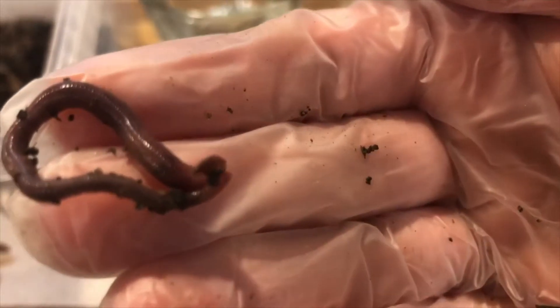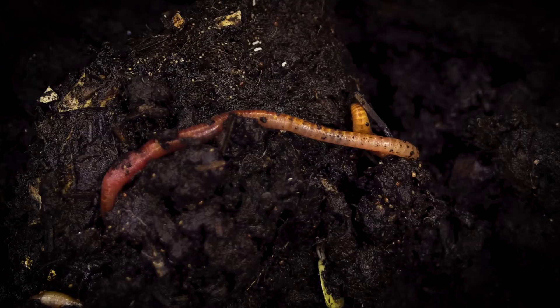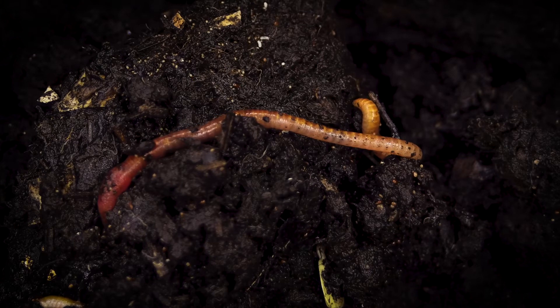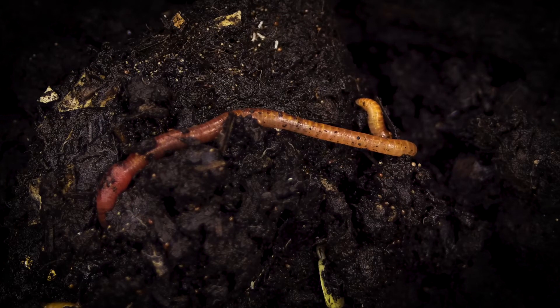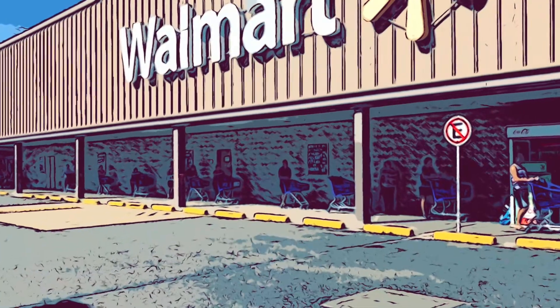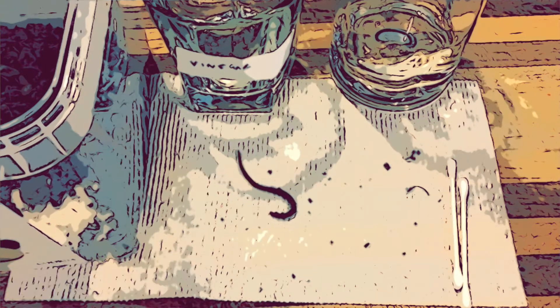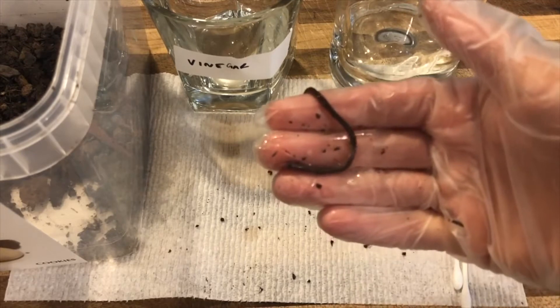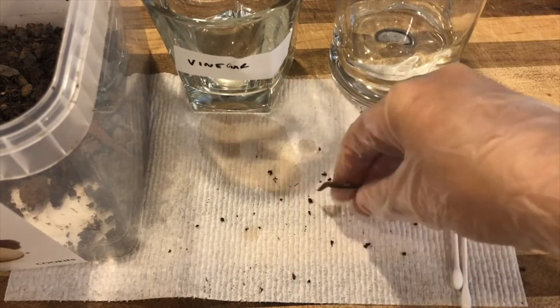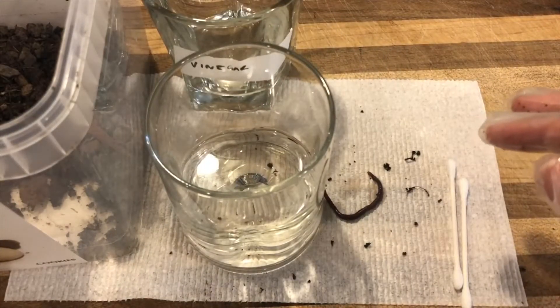One of my favorite labs to do towards the start of the year in biology is to practice observation and inference skills using live earthworms. Of course, you need to get permission from your school to do a lab with living organisms, but usually if it's an invertebrate, you do have a little bit more wiggle room. Worms can be found for super cheap at any store that might sell tackle or fishing bait. I usually go to the hunting and fishing section at Walmart and there's usually a fridge in the back with night crawlers for less than $3. Students make observations and inferences on the worm's behavior and follow a guided set of questions, seeing how the worm responds to different things like obstacles or water. It's a super fun way to get students interested about science at the start of the year.